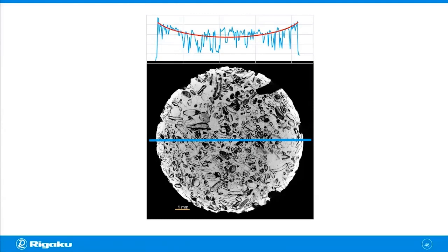Now let's try simple thresholding. If you set one threshold, your segmentation of the solid part would look like this. Let's zoom in a little bit. So you're setting, for example, the threshold so that those voids are not painted red. But at the same time, you have a problem towards the center where you see all those gray holes. They are not painted red, although they should be.